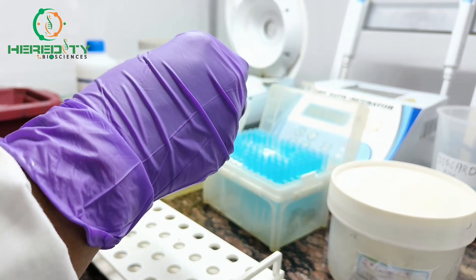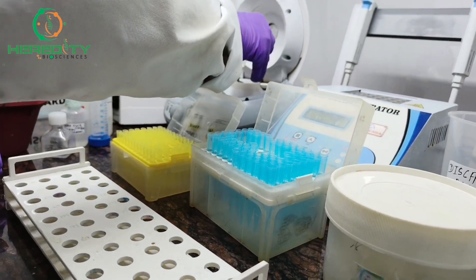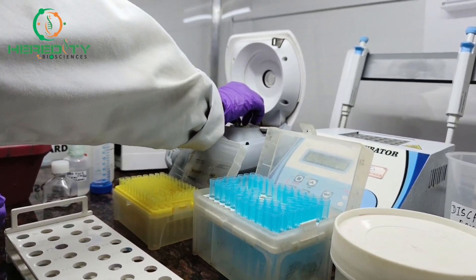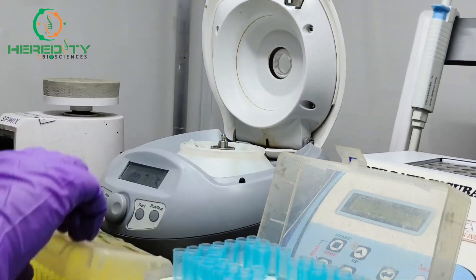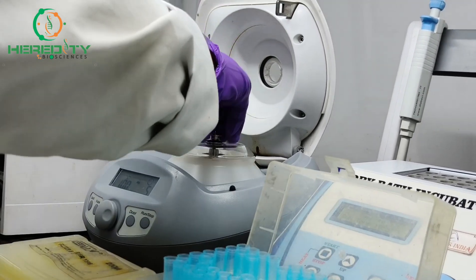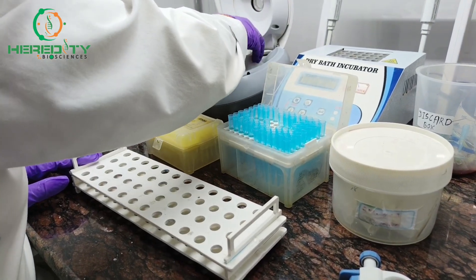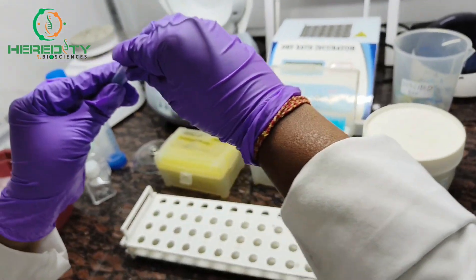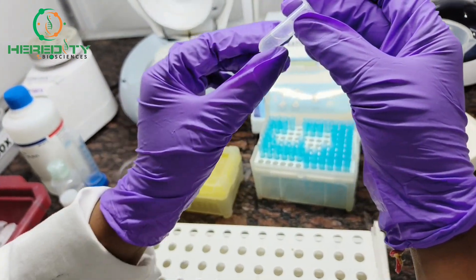After 5 minutes of incubation, we will centrifuge it at 10,000 rpm for 1 minute. After centrifuge, we will discard the supernatant slowly.